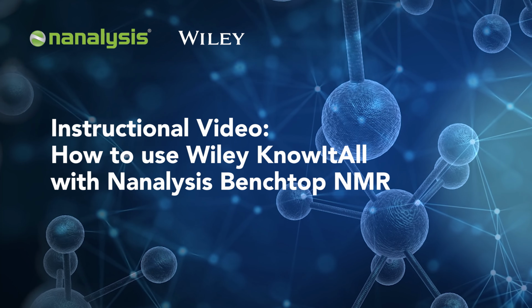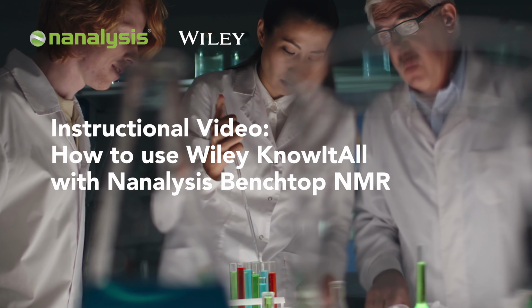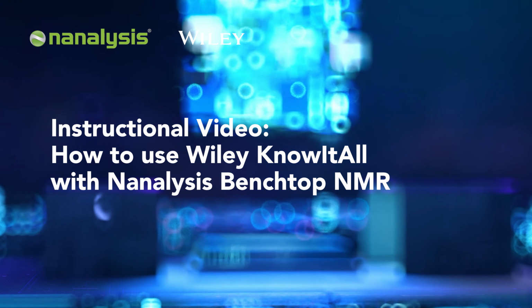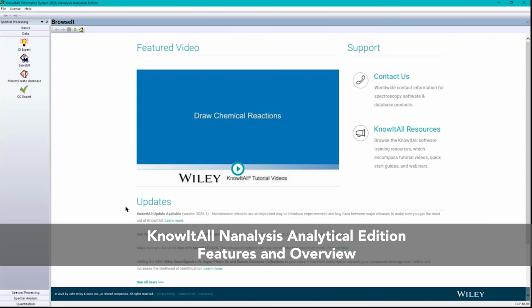Today we are taking a closer look at the recently released Nanalysis Analytical edition in KnowItAll, featuring the first ever Wiley Benchtop NMR reference libraries for 60 and 100 MHz, developed in collaboration between Wiley and Nanalysis. The software starts on the browser landing page, where you'll find notes on updates, upcoming events, and the latest news.